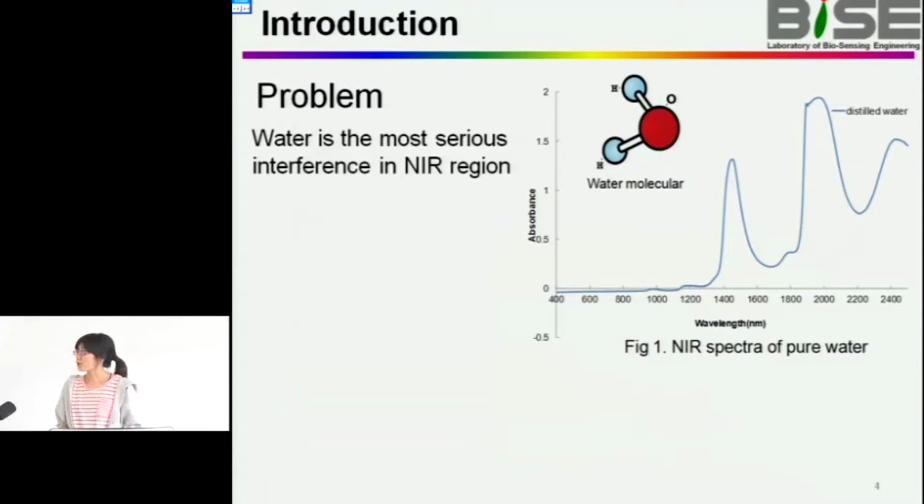In this study, I want to use NIR spectroscopy to detect coffee solution. But for solution detection in the NIR region, water is the most serious interference, because water has strong absorption in the NIR region.